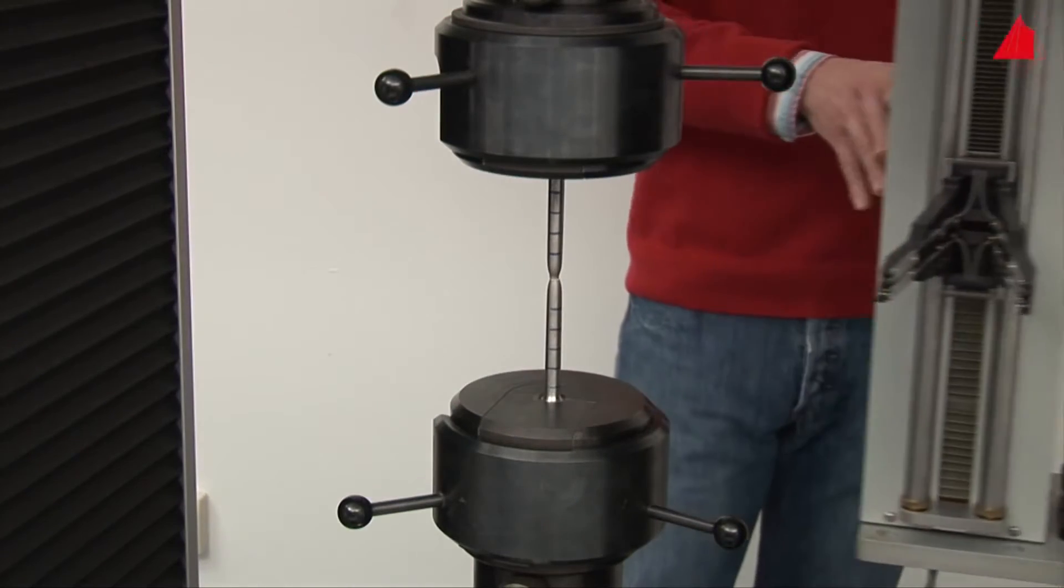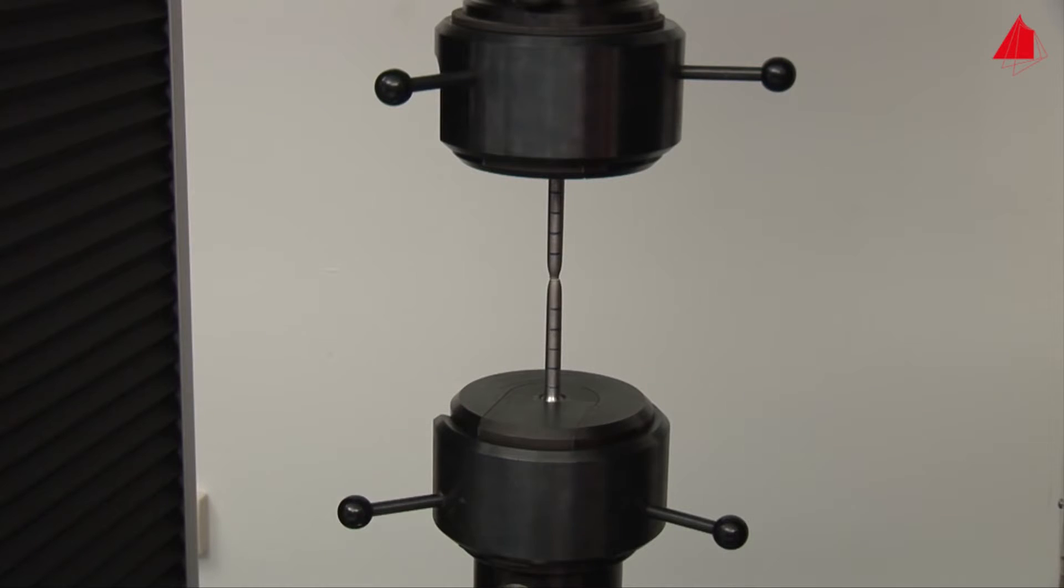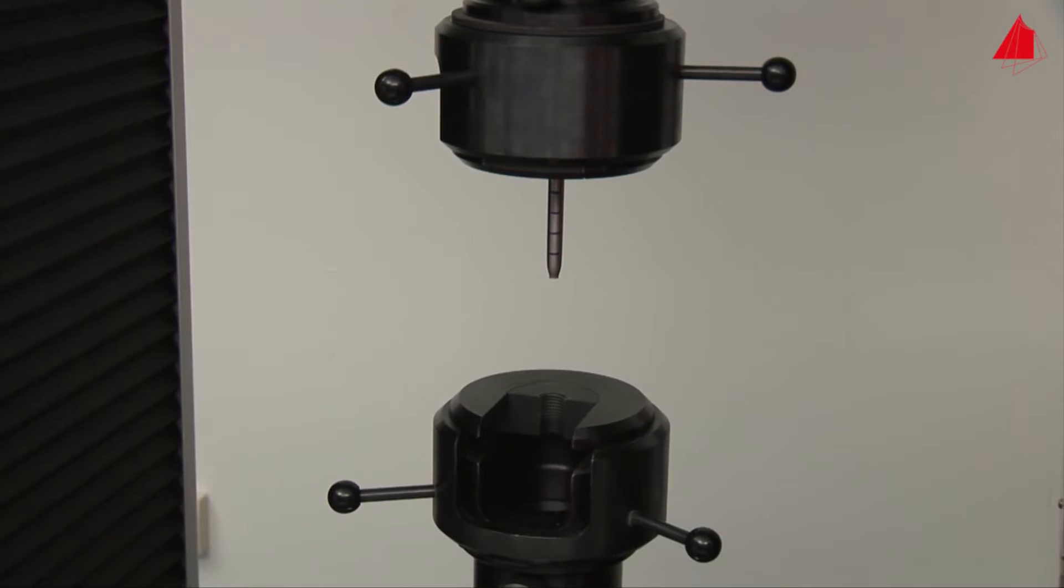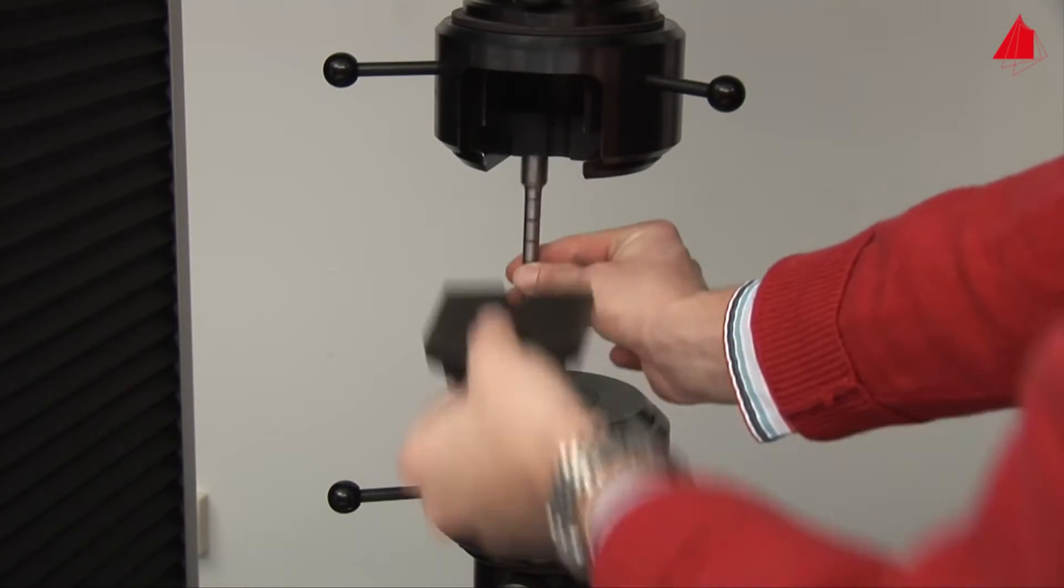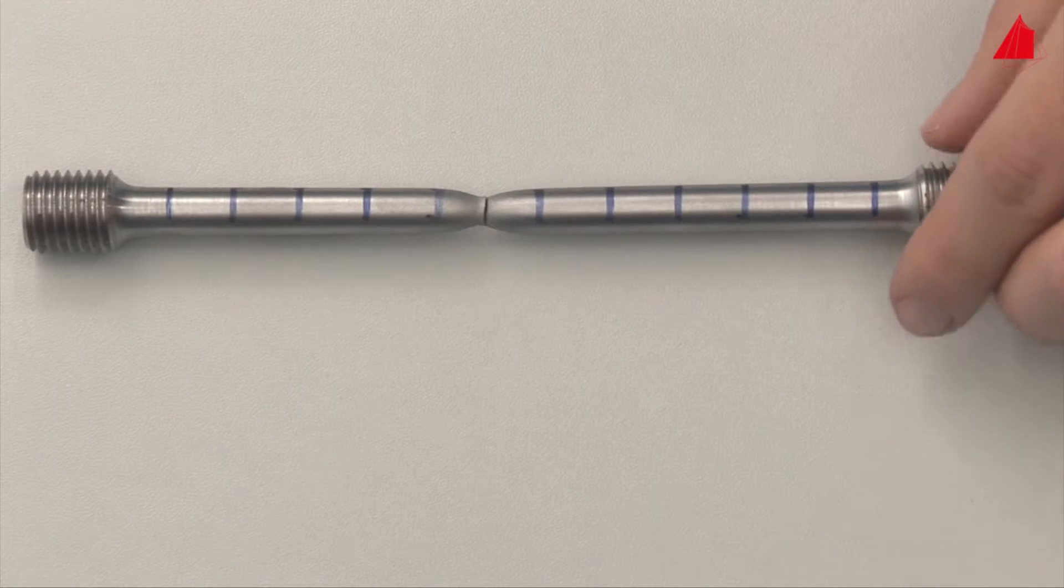In the last step, the tester swings the extensometer back into its resting position and removes the broken test piece. On the work table, he puts the fragments back together again.